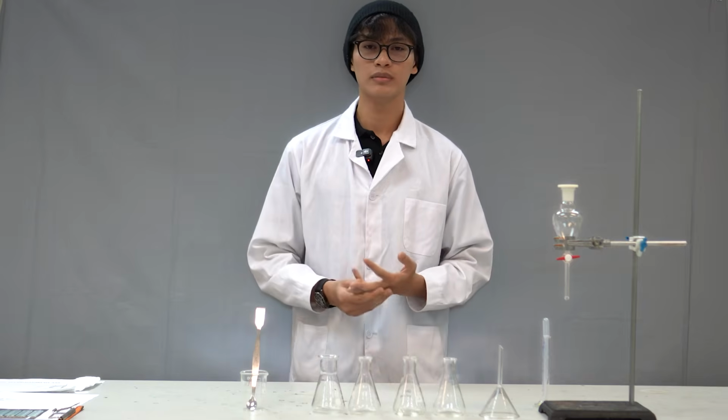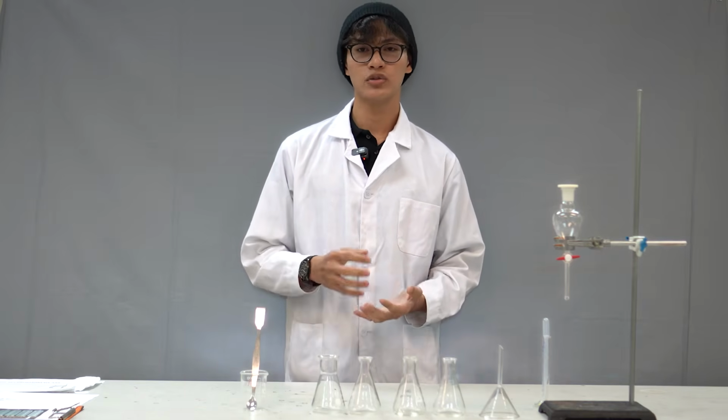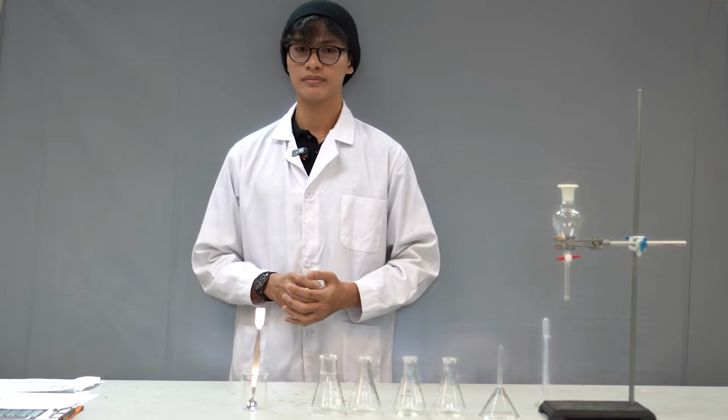This will convert them into water-soluble salts, allowing us to isolate the neutral component because the neutral component will remain dissolved in the water-immiscible organic solvent.